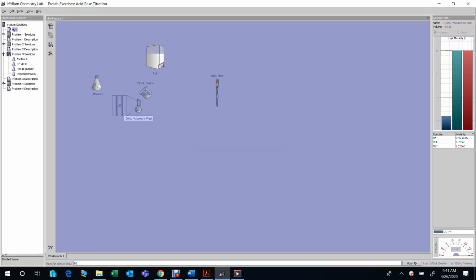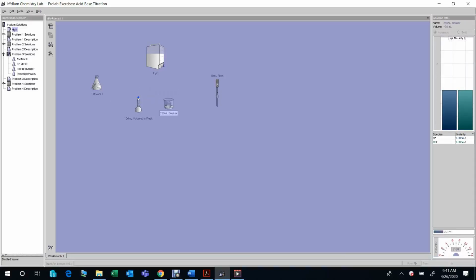So I try 80 milliliter. You see, at the bottom window, we try 80 milliliter, and then we do pour. Okay. When we click this flask and look at the right top, we see the volume is about 80 milliliter. It's not very accurate. It's just a piece of information. It has this kind of sign, meaning the volume is about 80 milliliter.